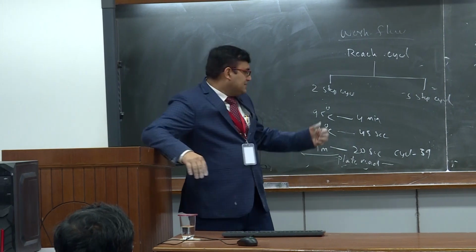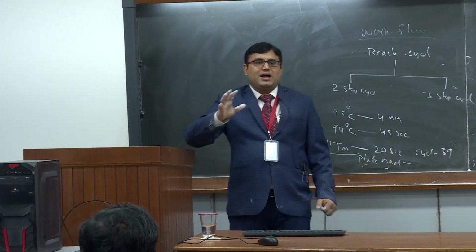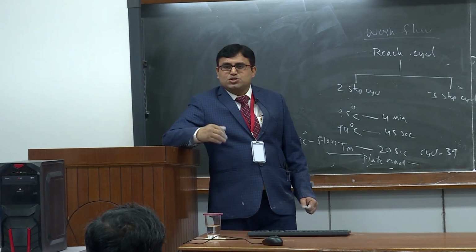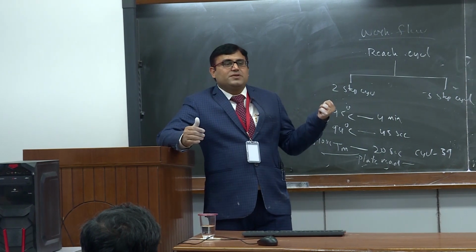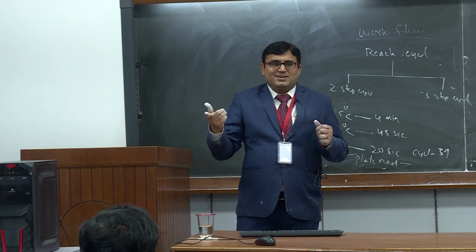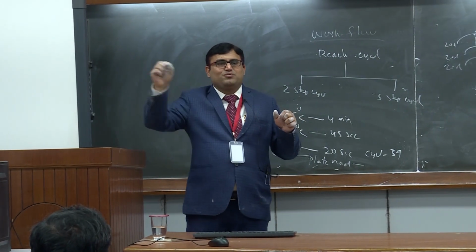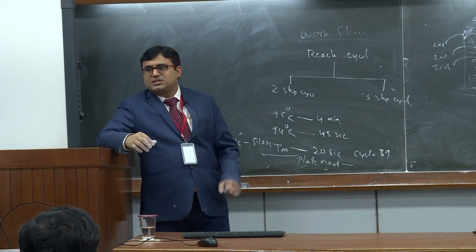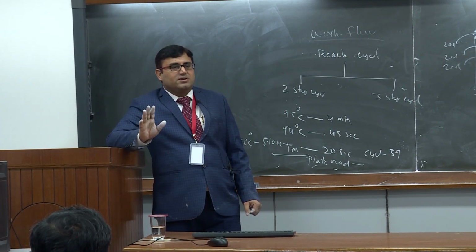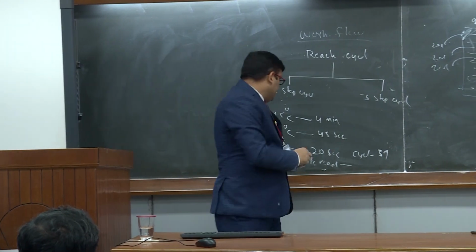Right? So now this is a cycle which you have to feed into the instrument, saying I want the two-step cycle or the three-step cycle. Once you feed this, the instrument will ask which one is your control and which one is your treatment. You have to feed that: well number 1 is my control sample, 4 is treatment. When you feed all this information, most of the work is done. Just run it and the instrument will give you the result in terms of CT value.